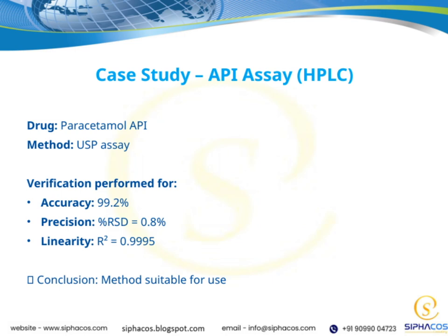This case study reinforces the overall message that thorough validation ensures our analytical methods are robust and fit for purpose, ultimately supporting safe and effective drug manufacturing.